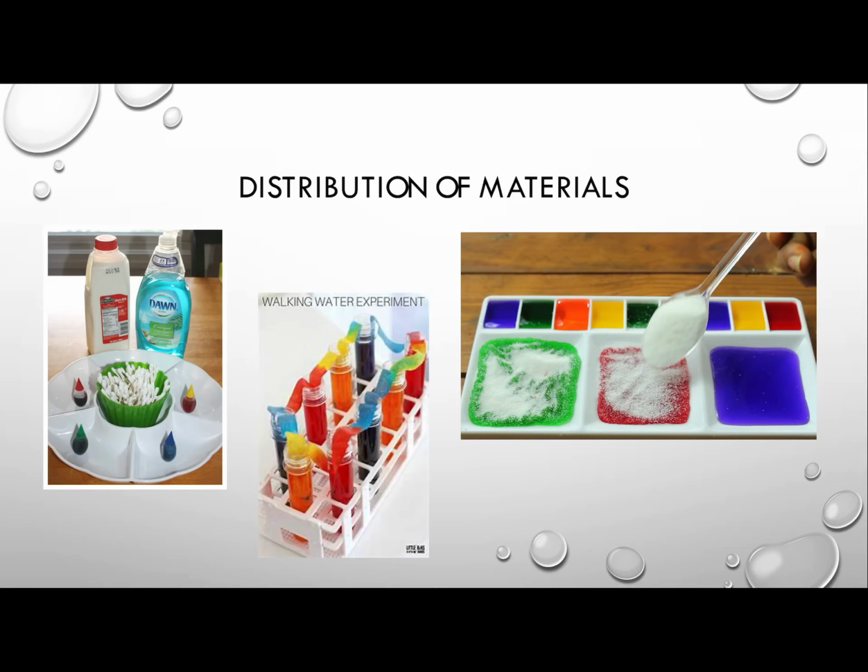And so they pour milk in there. They take a little bit of soap and put it on a Q-tip. And you put a few drops of dye in the milk. And when you touch the Q-tip to the dye, it spreads. It's hydrophobic. Water fearing, water loving repulsions. Kids love this experiment, and this is a really great arrangement that would allow 5 different kids to work side by side, maybe around a small table.